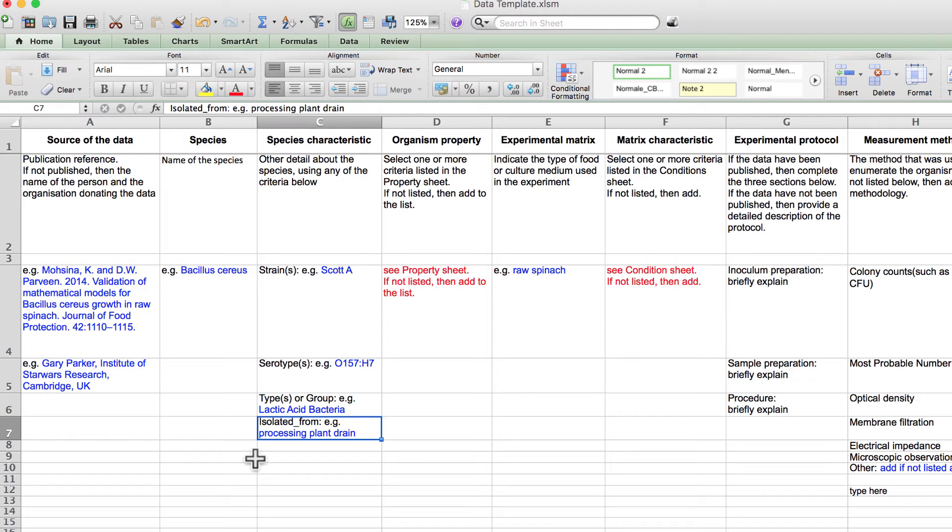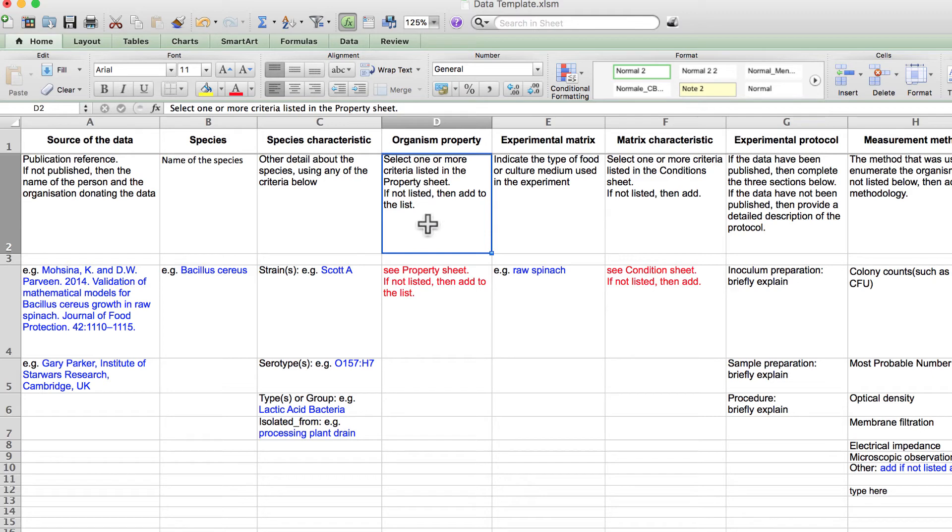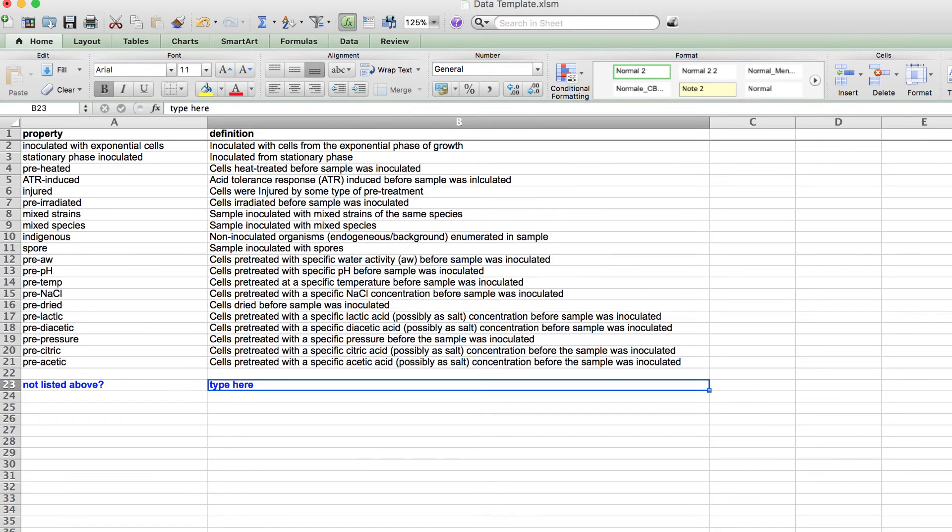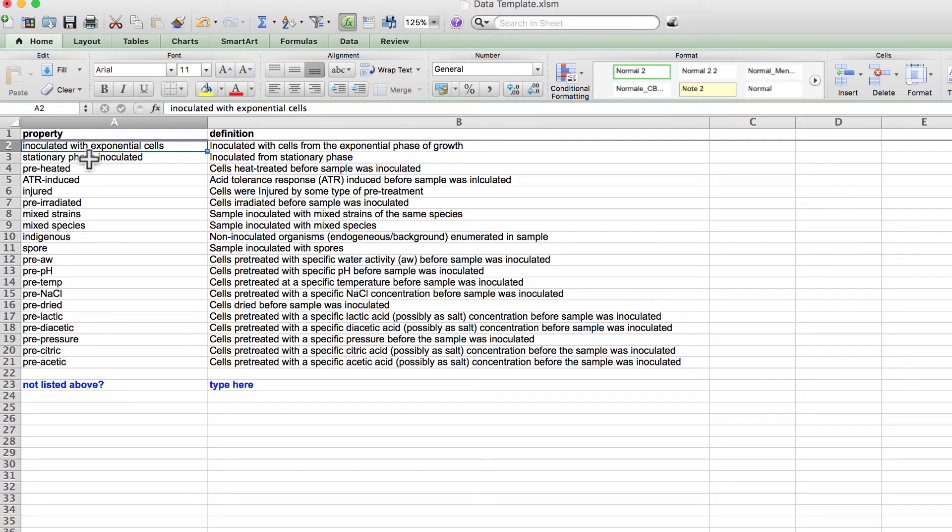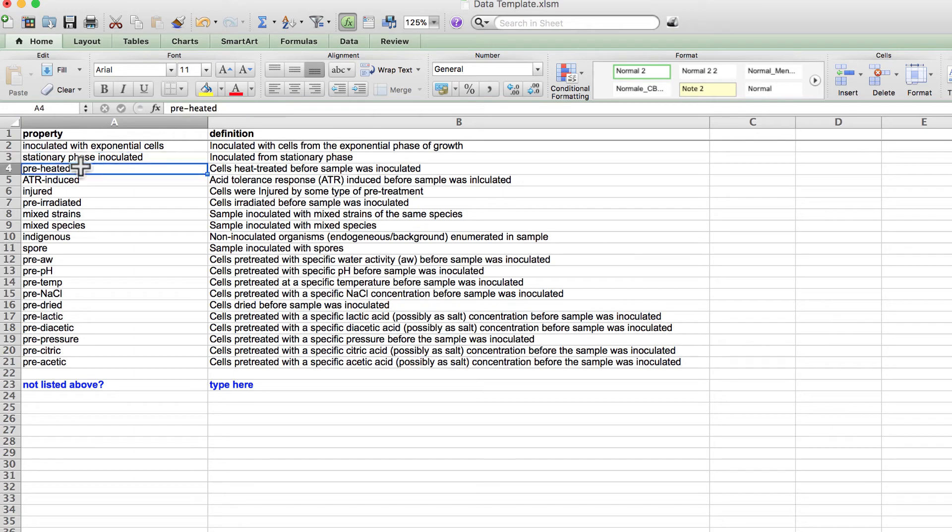Column D describes additional details about the microorganism and how it was treated before it was inoculated into the sample. To see examples of these characteristics, let's take a look at the property sheet. You can see that this may include the phase of growth before the organism was added to the sample.